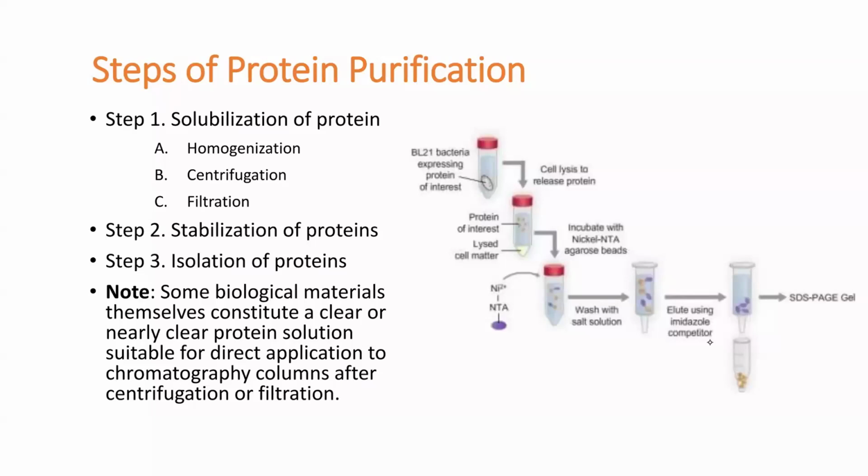Okay, but the most important thing you should understand here is that we are interested in isolating the proteins. This process involves a lot of techniques, and at the end, after you apply all these techniques, you will end up having your proteins. From there, you will be able to determine the amino acid sequence.